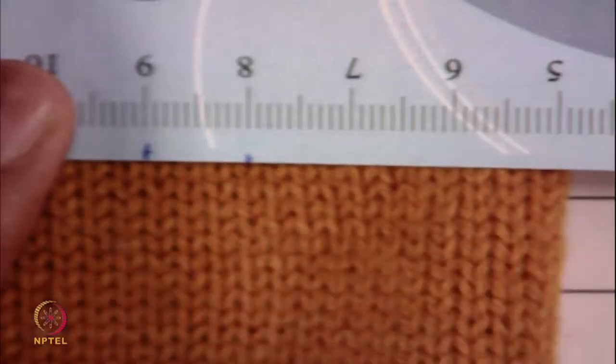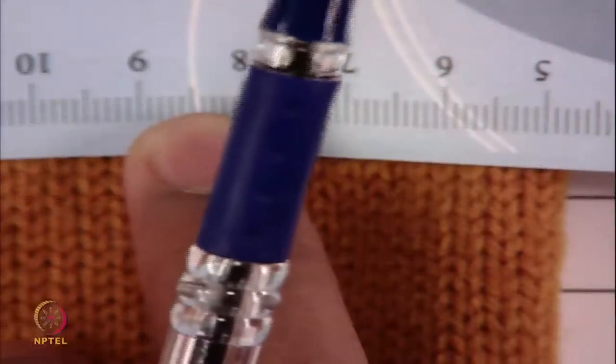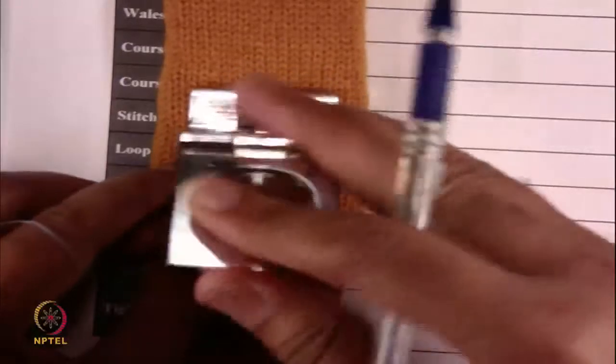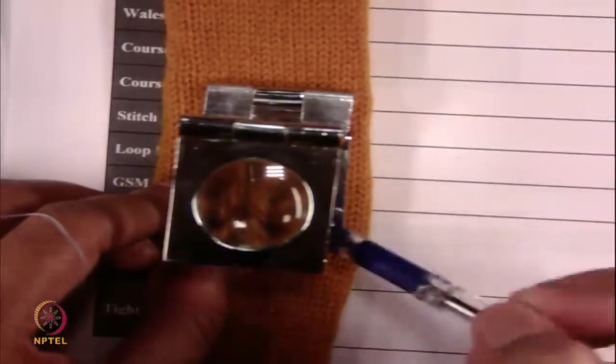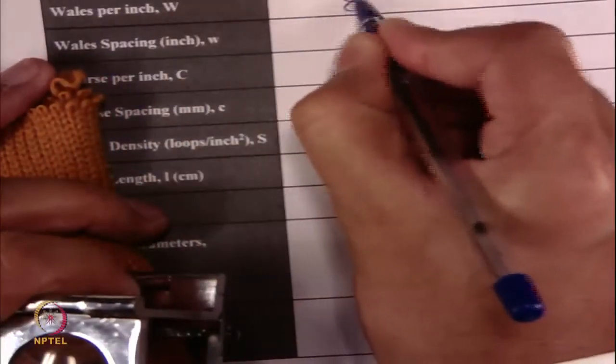So, how many columns you can count per unit length, and that length is inch. Sometimes we use pick glass, this is the normal pick glass, and this is automatically 1 inch. You can put the pick glass, you can put the lens here, and you can count how many wales are there. This process is very simple. So, right now number of wales per inch is 8, okay.